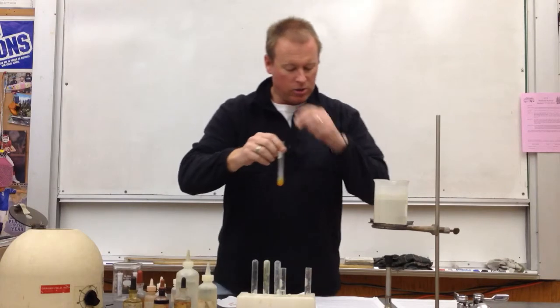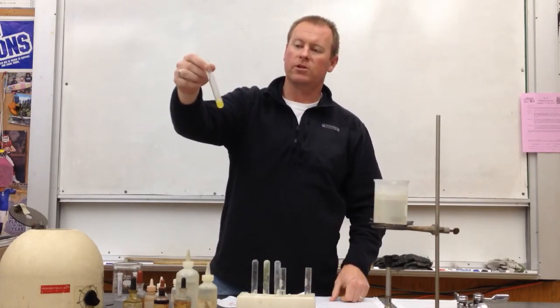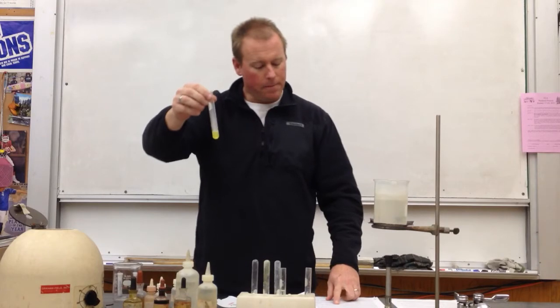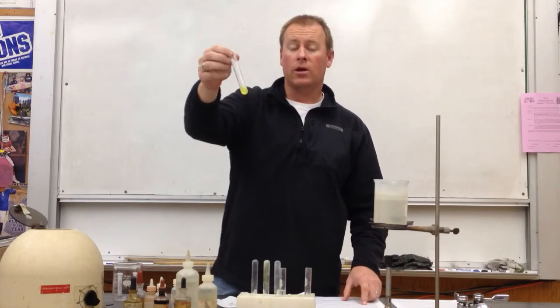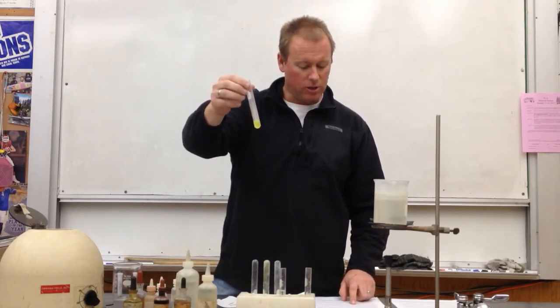And then again, you can stir it or you can shake it. There's only a small amount of precipitate, and 10 drops of HCl is not a lot. In this case, this is enough to dissolve that rust-colored precipitate. It says, if after thorough stirring precipitate remains, add HCl dropwise. We don't need to do that because all of this precipitate has dissolved, and now we have this yellow-colored solution.